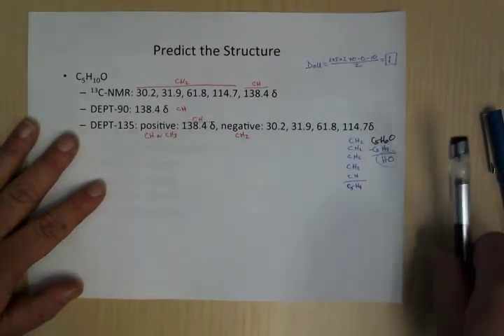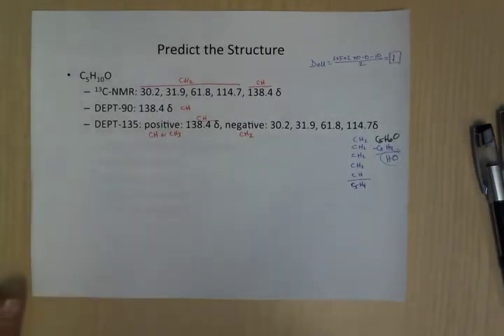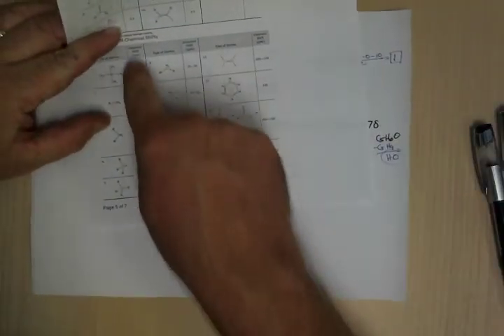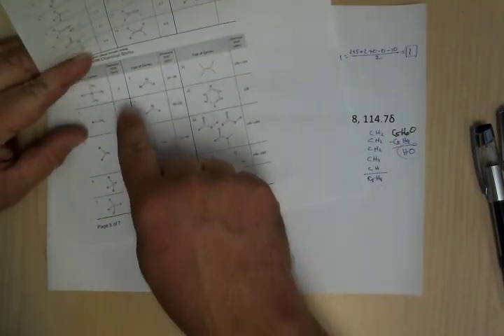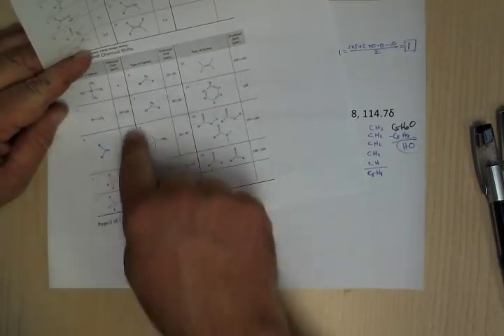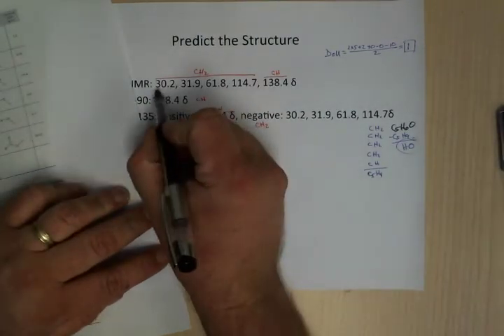Okay, so next look at the chemical shifts. Here we look at the carbon NMR shifts, and again, I'm going to give you this chart. These down here in this range are going to be just regular alkanes.